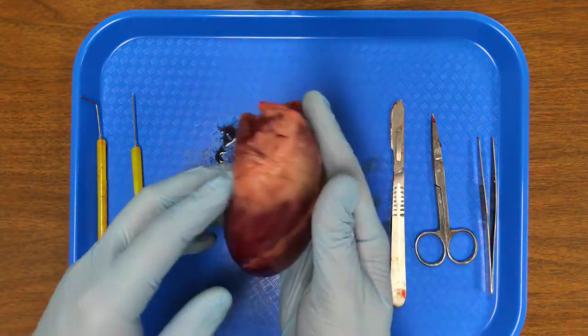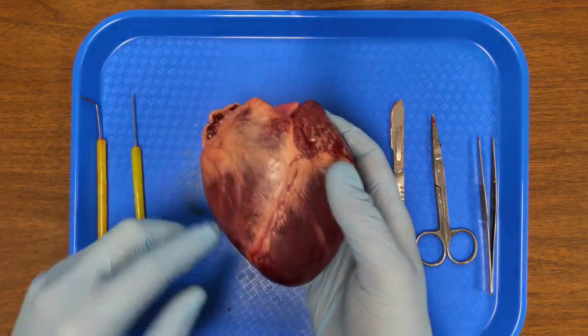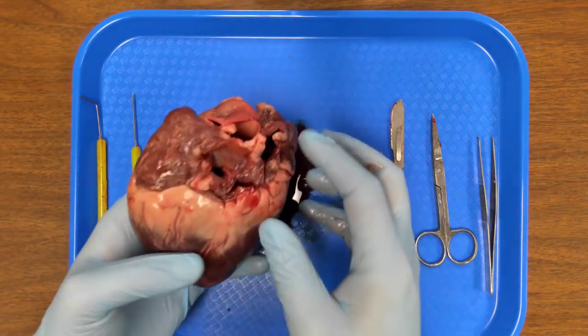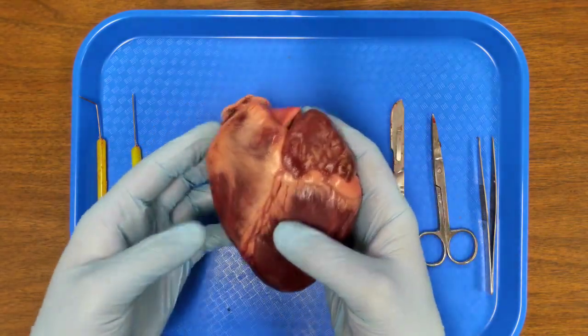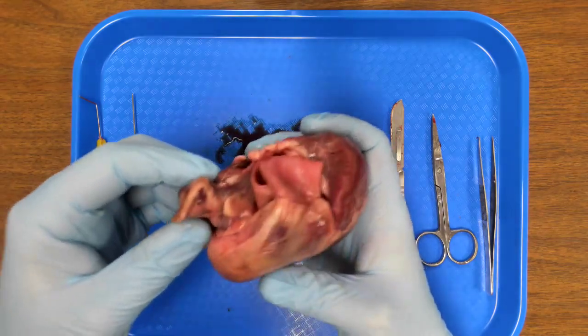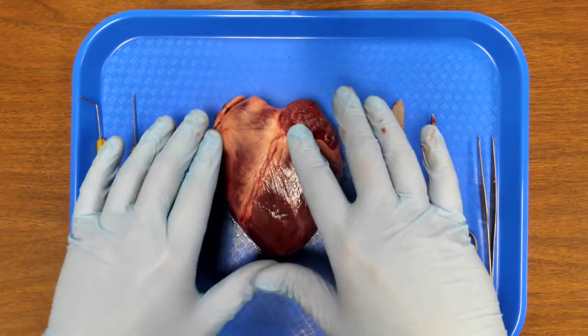This white stuff around the heart, this is fat. Okay, so we can see quite a bit of fat here on this heart. That means that our pig was nice and fat. Up top, in the front, just for a little anatomy here.